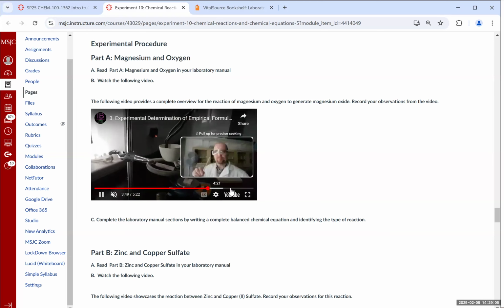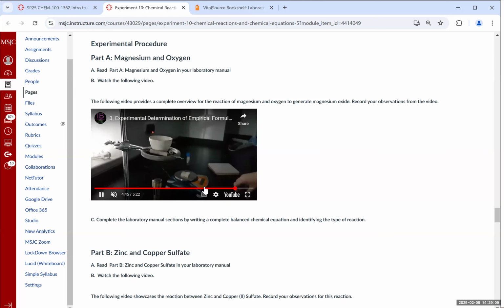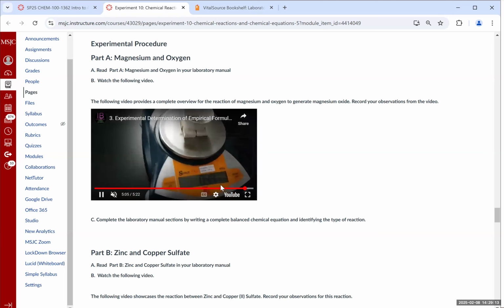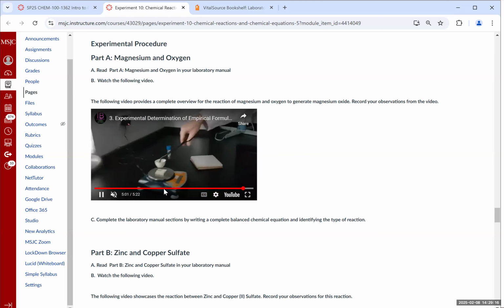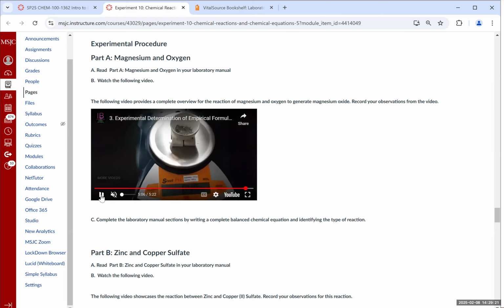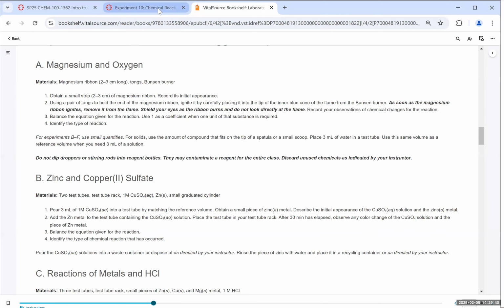So they're going to do another heating cycle, and let's just skip to the point where they take their finalized sample. Okay, so, looking inside the crucible, the magnesium looks quite different compared to when we started this reaction because it's no longer magnesium, it's magnesium oxide. And we can see that because there's a huge change in appearance.